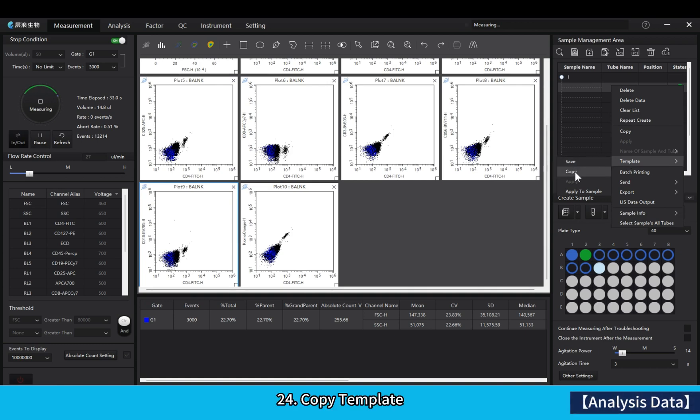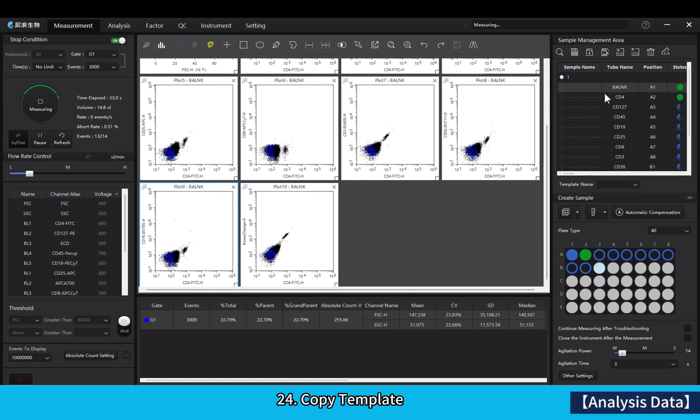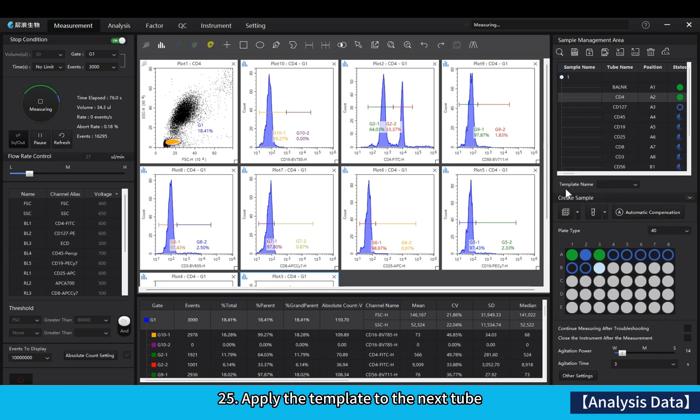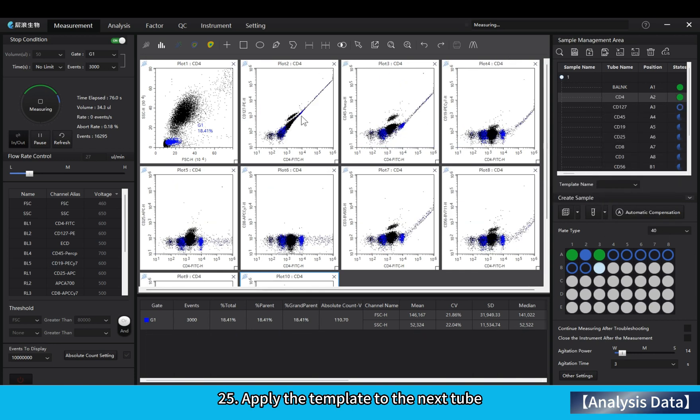Copy template. Apply the template to the next tube.